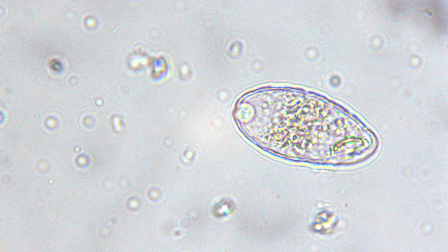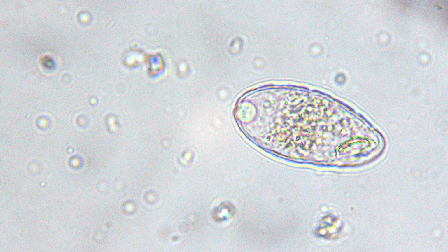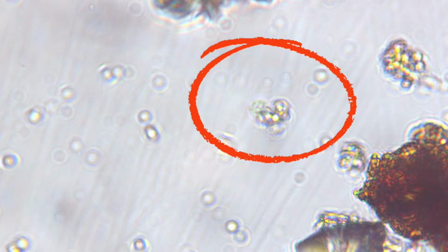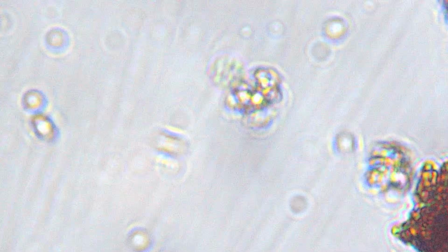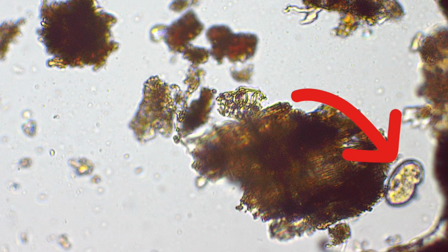Protozoa. Protozoa are secondary decomposers that feed mostly on bacteria, releasing nutrients and plant growth-promoting hormones back into the soil. They also thrive in and indicate high moisture conditions. Testate amoeba have a shell with a distinct almond or balloon-like shape and an opening on one end. Their shells sometimes have a subtle pattern of tiny scales. Flagellates have one or two long whip-like appendages that they use to propel themselves around. Ciliates have tiny hairs around them, which allow them to move quickly in moist environments. Finding many in a sample can indicate anaerobic conditions.